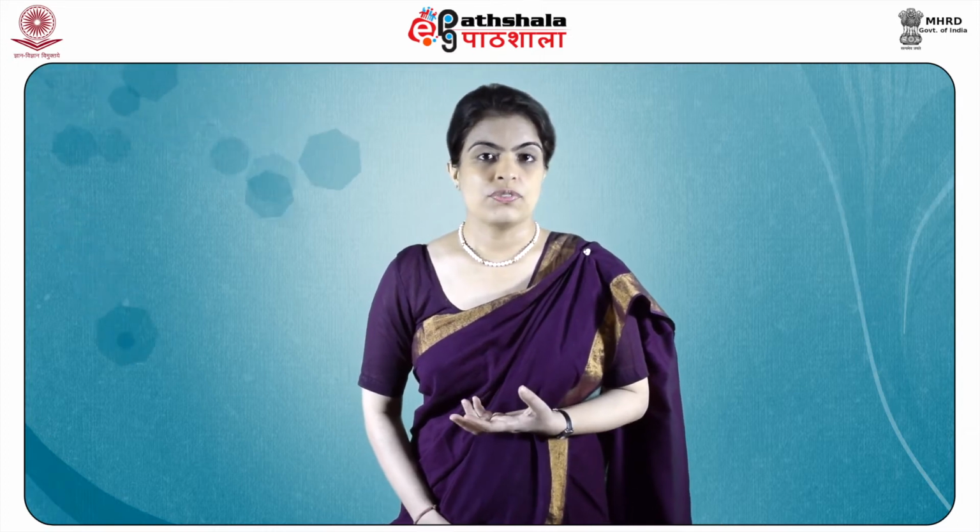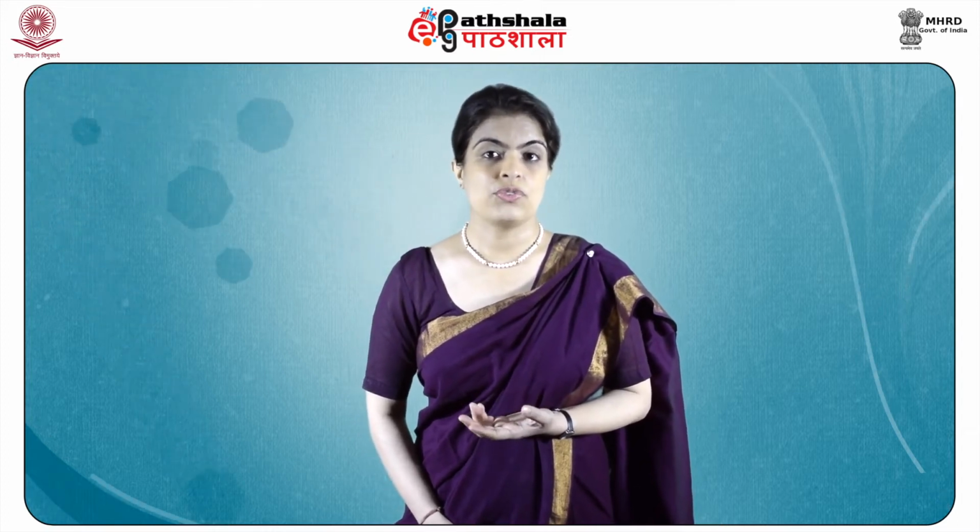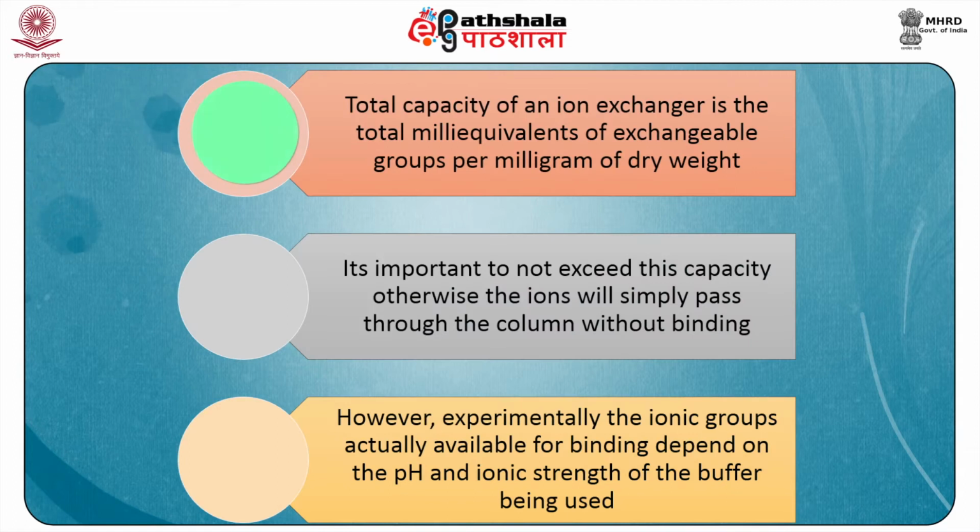These are total capacity of the resin, available capacity of the resin, its porosity and its mesh size. Total capacity of an ion exchanger is the total milliequivalents of exchangeable groups per milligram of dry weight. It's important to not exceed this capacity, otherwise the ions will simply pass through the column without binding.